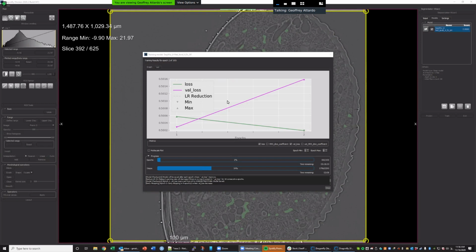It's going fairly slowly. I made 3 frames. Okay, 3 frames, and the size of the frame also matters. It looks like you have a big size for the frames in terms of how many pixels in the frame.